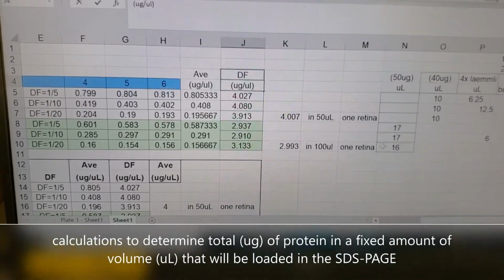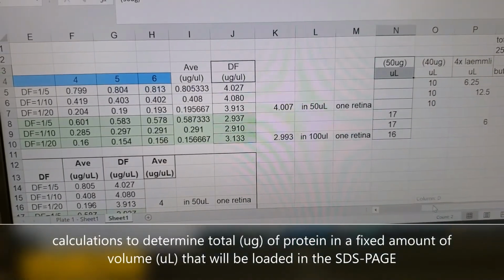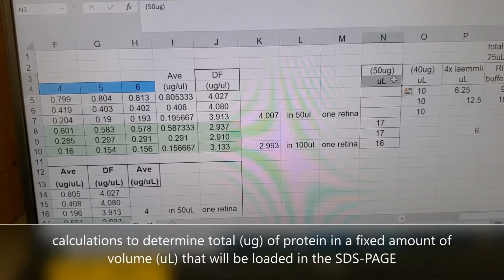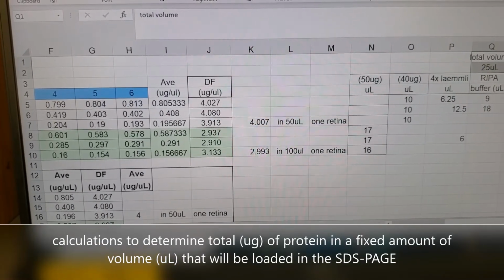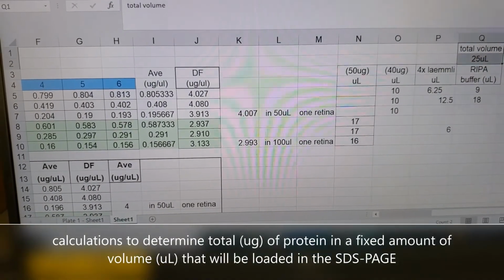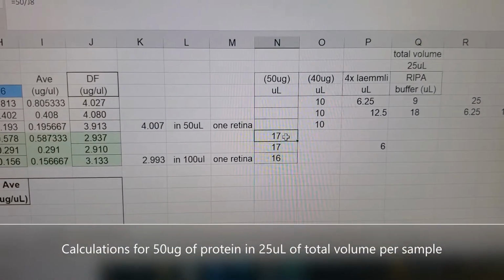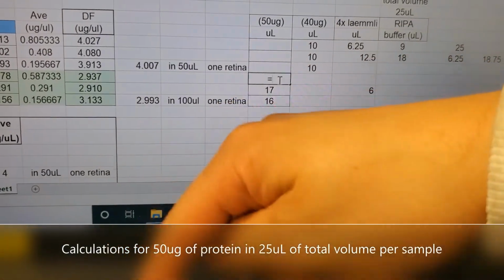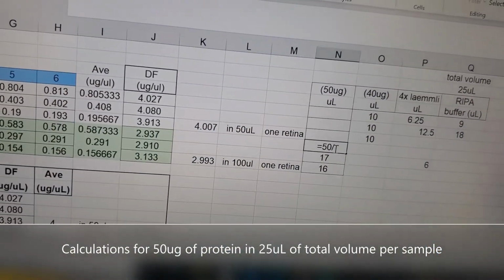And so right now, for one of my samples, I'm going to prepare 50 micrograms. That's the total amount of protein I want in my sample. And I want that sample to be in a total volume of 25 microliters, meaning that when I load into the SDS-PAGE, I am going to be loading 25 microliters. So the first thing that I do here, if you're doing this in Excel, is equals 50 micrograms divided by your concentration.